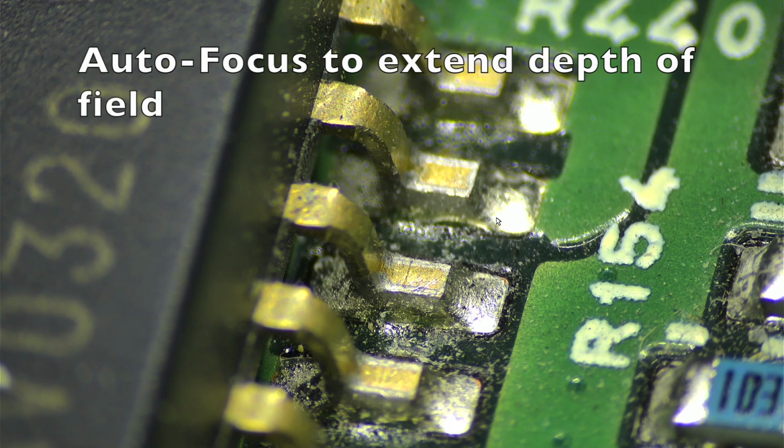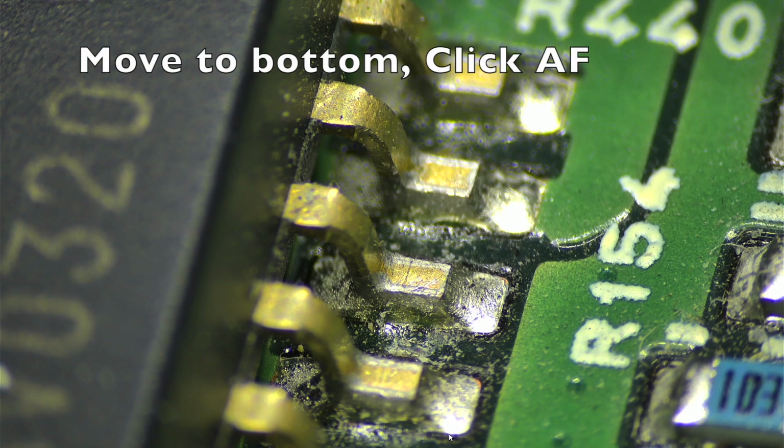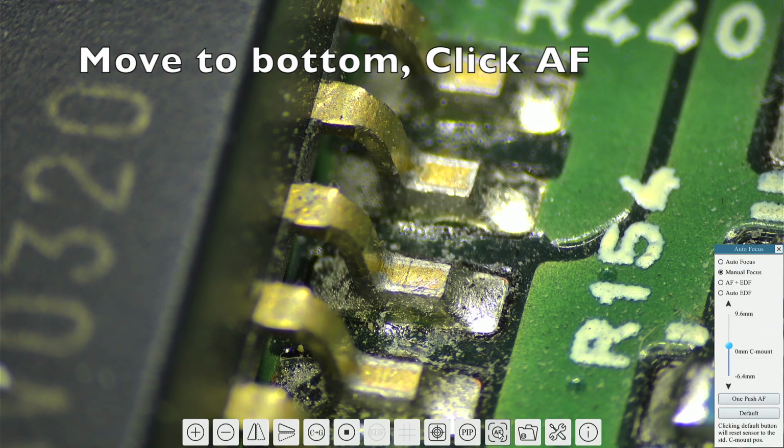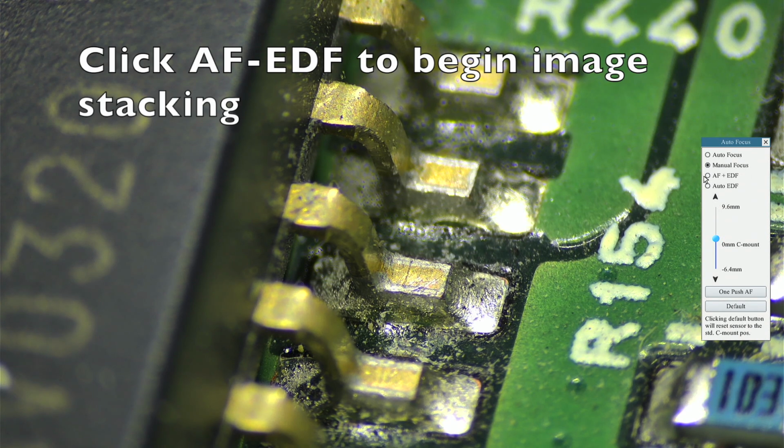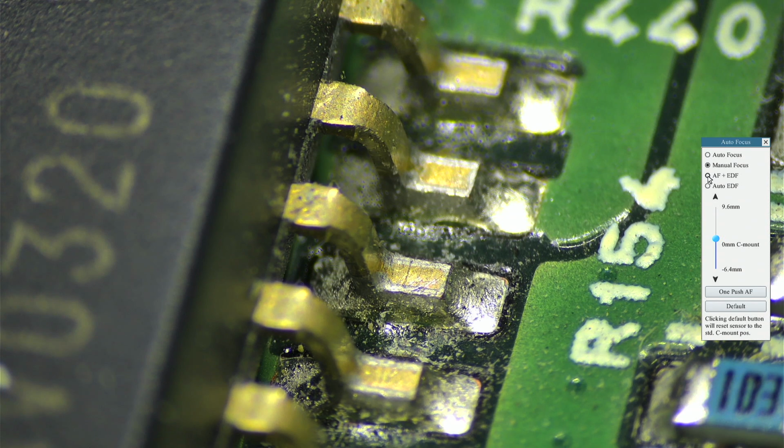The latest HD4K camera uses autofocus and image stacking to create a picture with extended depth of field. To do real-time image stacking, move the mouse to the bottom and click the AF icon. Choose AF EDF to start the image stacking process.